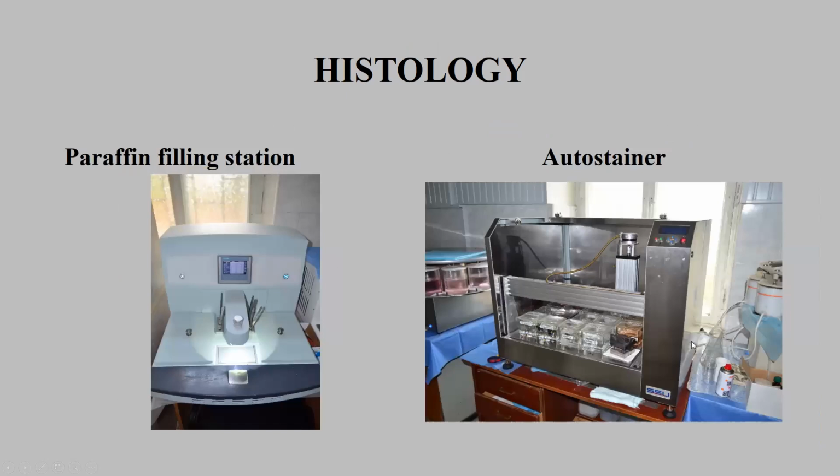This is an auto stainer. It's homemade in Sumy State University. There is a robotic arm which puts these cassettes with non-stained slides into different liquids.